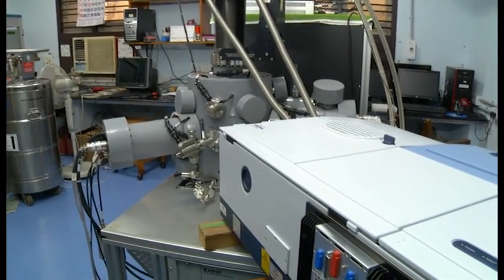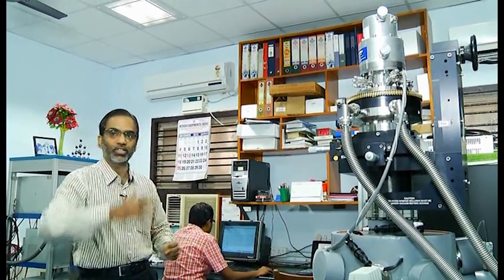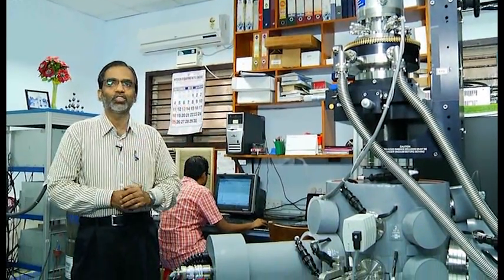And then study the scattered ions with another mass spectrometer. This whole thing would be called a reactive ion scattering spectrometer, which is coupled with infrared spectrometer and a few other spectroscopic facilities. As a whole, this is a very unique kind of instrument.